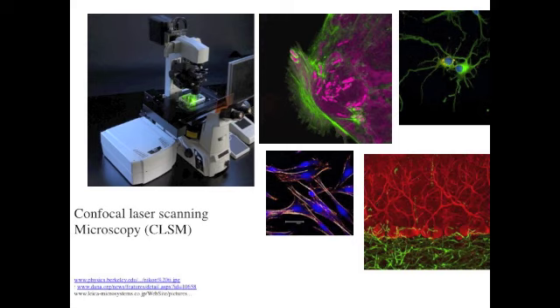So this is another light microscope, but unlike the compound and stereo microscopes, the confocal laser scanning microscope is reserved for research organizations, and it allows us to scan samples in depth. A computer is able to assemble the data to make these really cool 3D images that you can see in this picture. They use UV light and really high resolution for that depth selectivity.